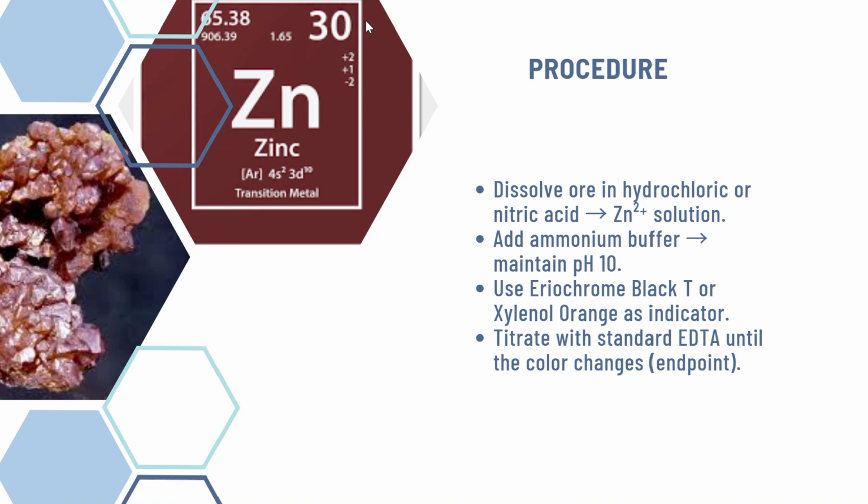An indicator such as Eriochrome Black T is used, changing from red to blue at the endpoint. The solution is then titrated with standard EDTA until the color change signals completion.